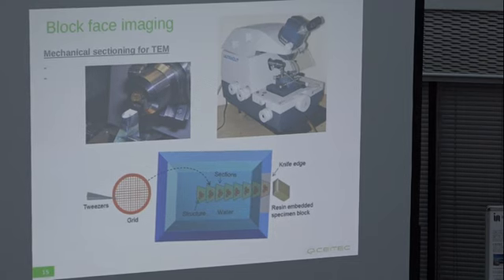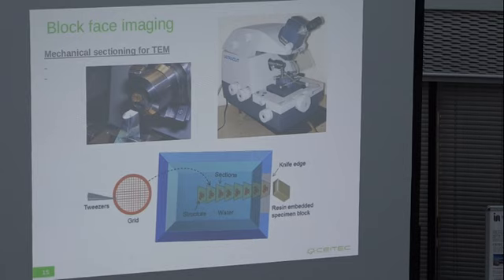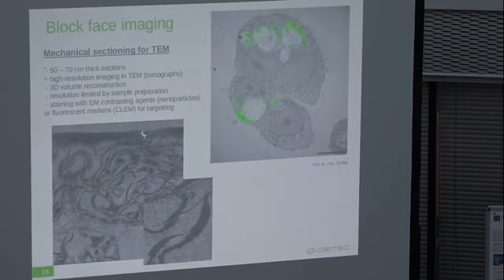And what you can do, you can use this instrument, which is an ultramicrotome, and slice very thin slices, which are 50 to 70 nanometers thick, let's say. The slices will come on the water level, and then you can manually pick them up with the TEM grid, which is a standard carrier for transmission electron microscopy, and transfer such a sample to the transmission electron microscope for imaging.